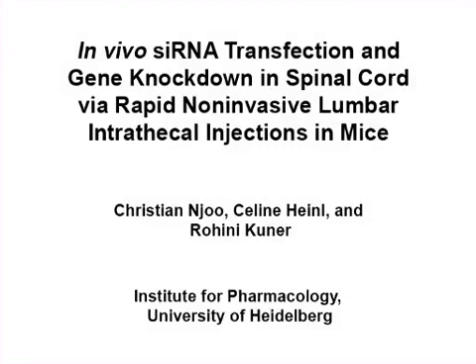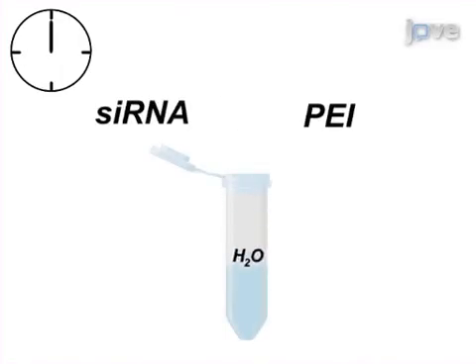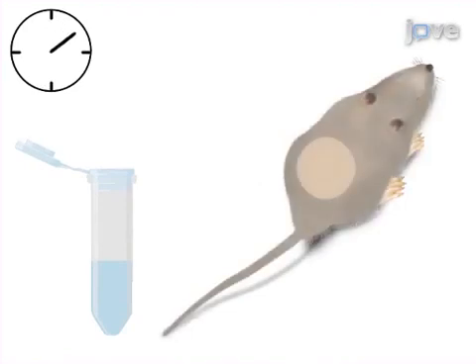The overall goal of this procedure is to locally apply siRNA via intrathecal delivery into the spinal cord. This is accomplished by first preparing the optimal siRNA-PEI complex reagent. The second step is to prepare the mouse for intrathecal injection.